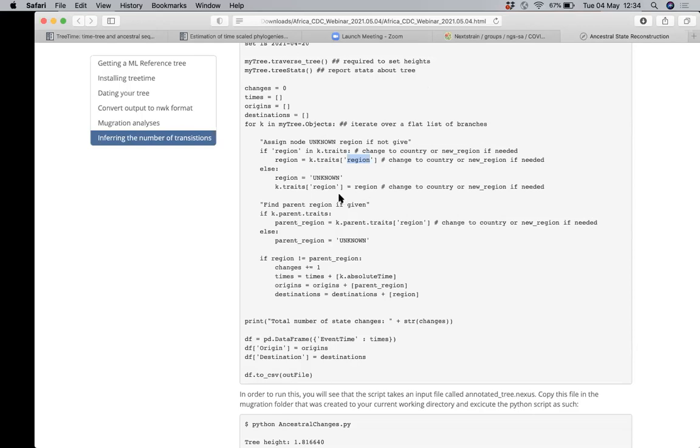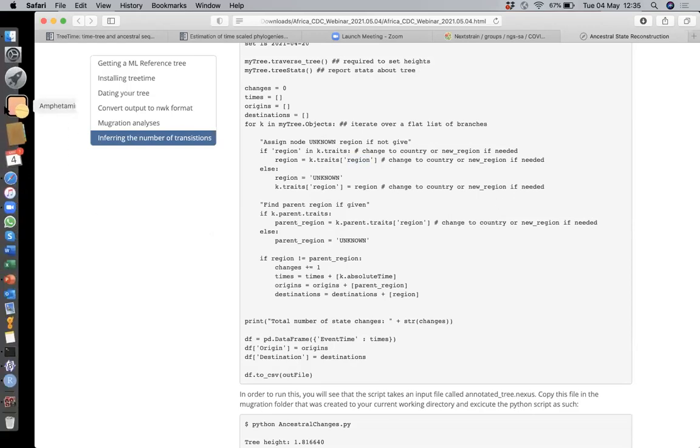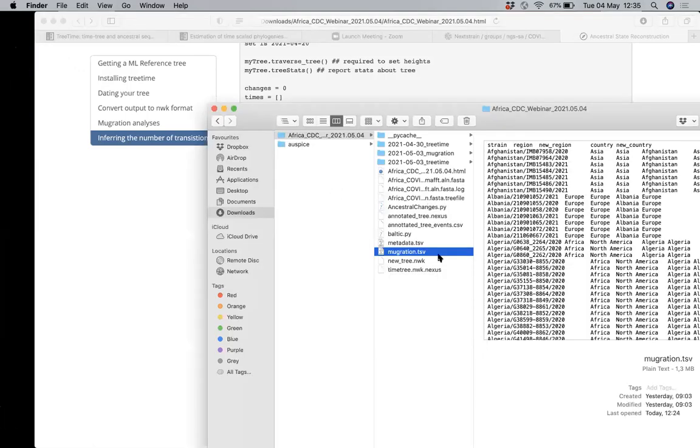Eduan, I also just want to note, maybe if you can open the final file again, that in the scripts we viewed last week, we didn't have time to go through this one, but we also have some scripts to visualize this. So participants can feel free to go back to the scripts and try to plug in this file and get nice visualizations on the import-export analysis. Yes, that's what I was going to do this afternoon.